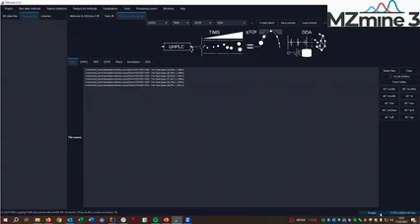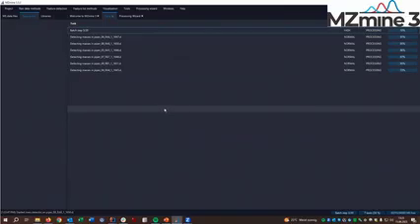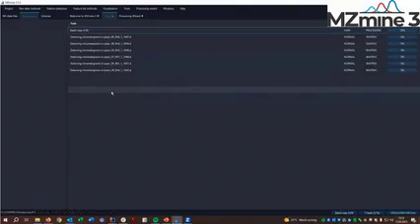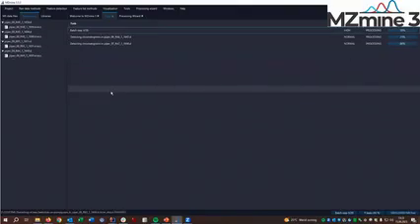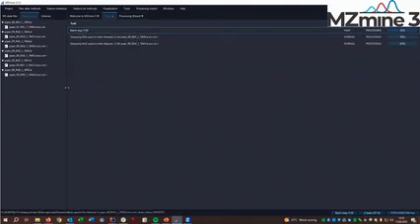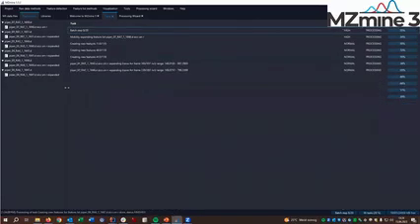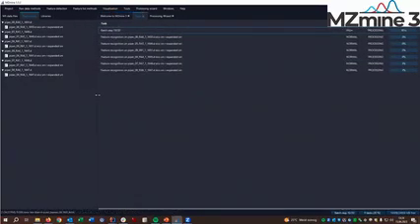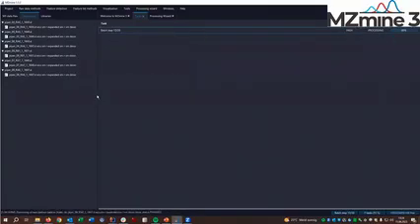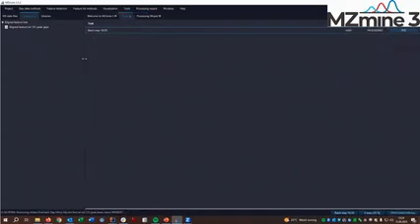And now you can see this is running. It's creating some tasks that are processing. First, detecting the masses, so detecting the individual ions in the different types of scans. Then, can't really see on the screen, but it's now doing the feature detection, so the chromatographic dimension, and then the resolving, assigning the MS scans to individual features, and follow up by the alignment, and also the spectral library search for annotation.